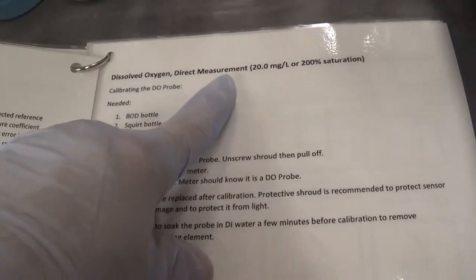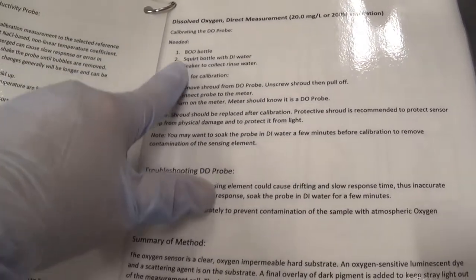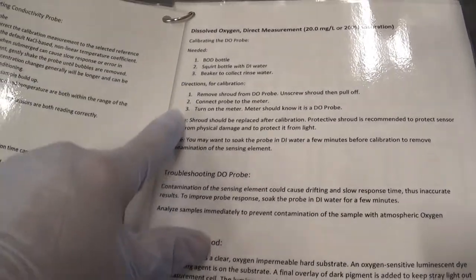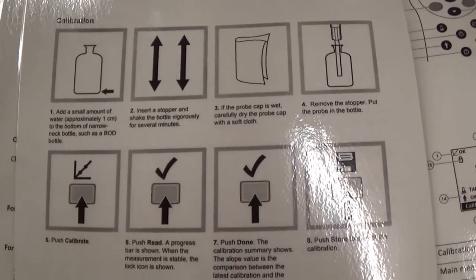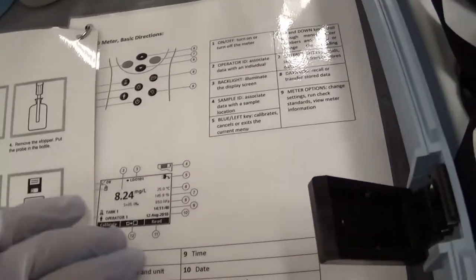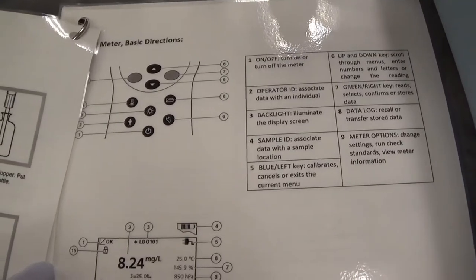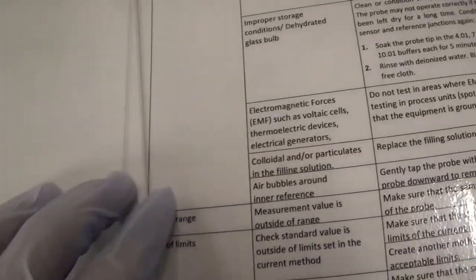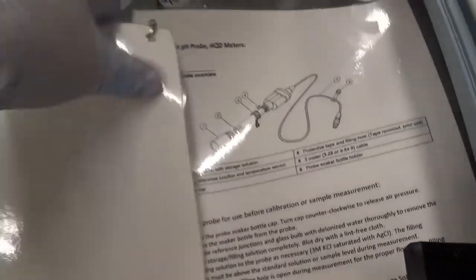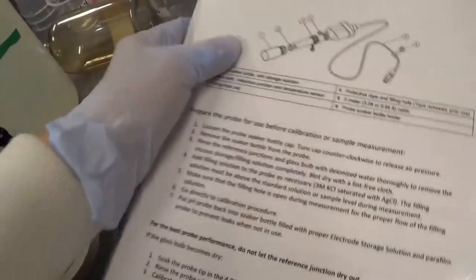We also have dissolved oxygen directions for calibration and troubleshooting. In here is what are all these buttons and what does the screen have. More troubleshooting on the meters. And that is it for our directions. First, we are going to do the pH probe.